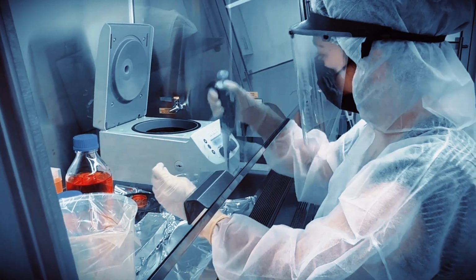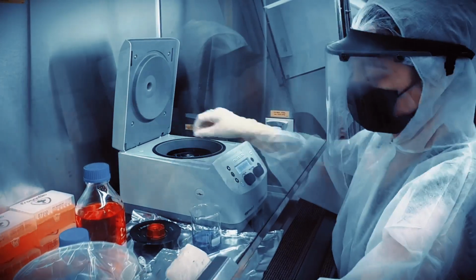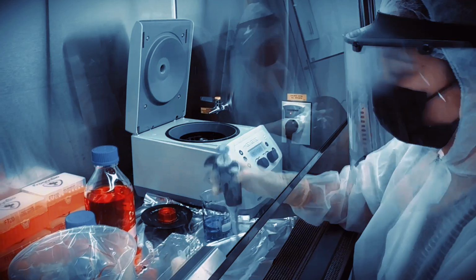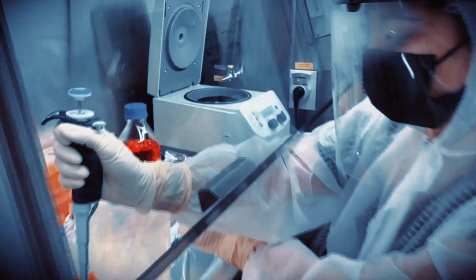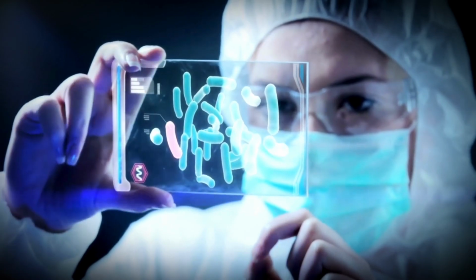These DNA fragments are incredibly small and exist in extremely low concentrations. Extracting them requires highly sensitive techniques, precision, and extreme care, preserving every molecule that might hold a clue to our distant past.